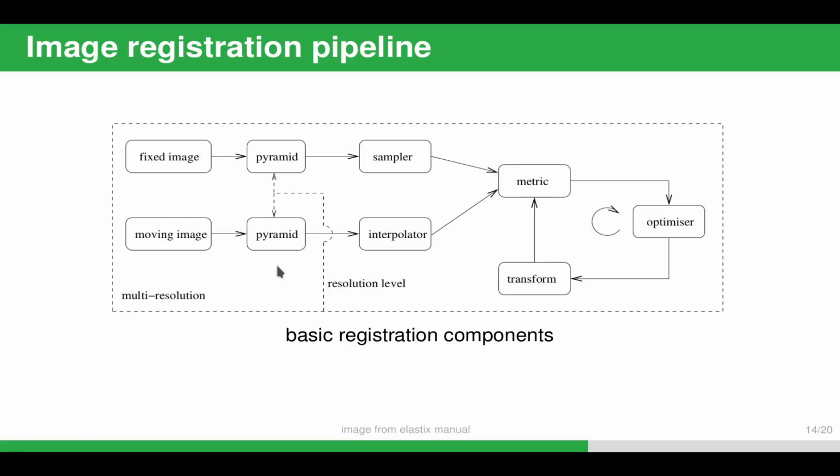The registration algorithm itself may downsample the images to form what is called a multi-resolution pyramid. So first, it takes these images and downsamples them a lot, so you have a very low resolution version of these images, and then it does this loop, and it finds a transformation. Then it uses a slightly less downsampled, let's say a medium resolution version of these images, and updates the transformation, and then finally uses the highest resolution versions of these images and runs the algorithm some more.